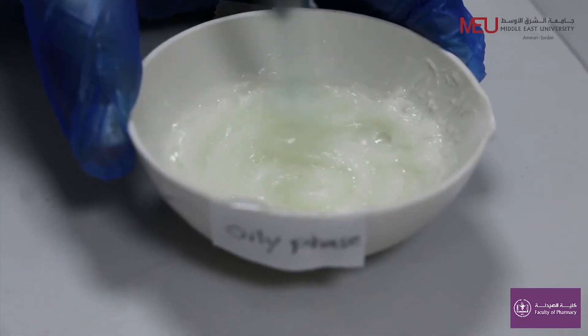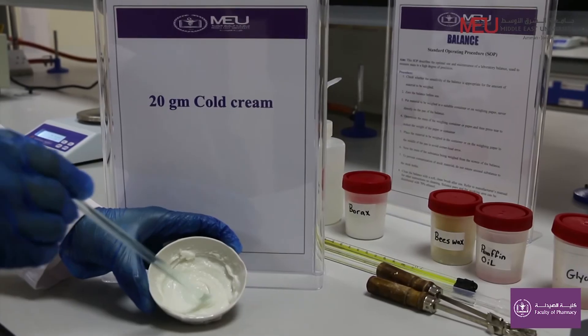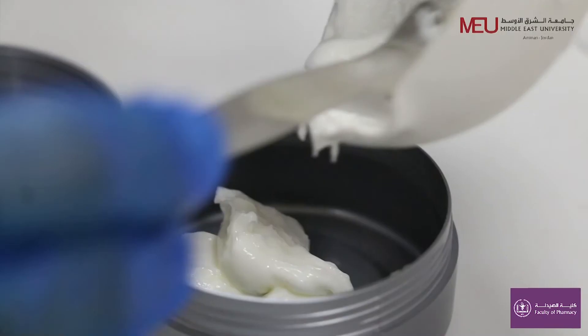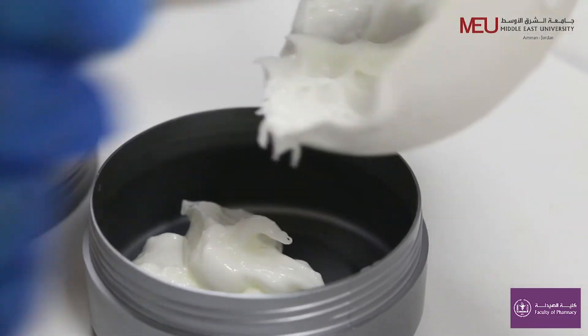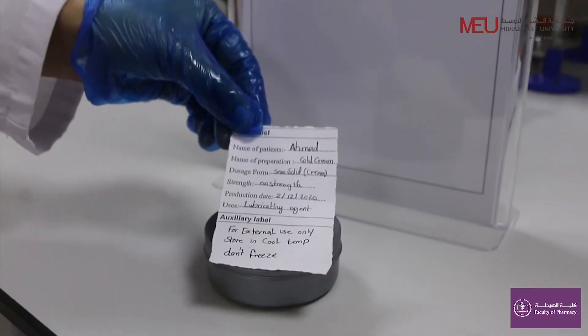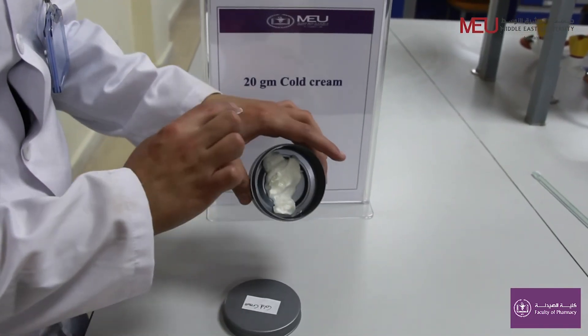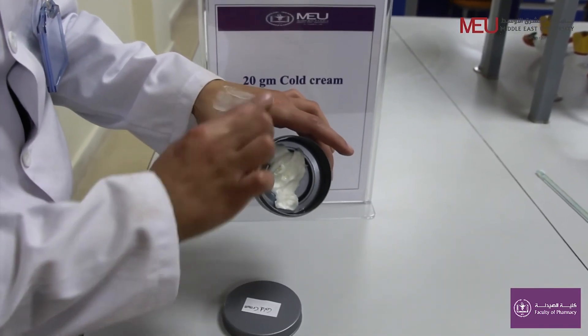Stir continuously until it becomes cool and cold cream is formed. Pack in a jar and label it with proper labeling. Thank you.